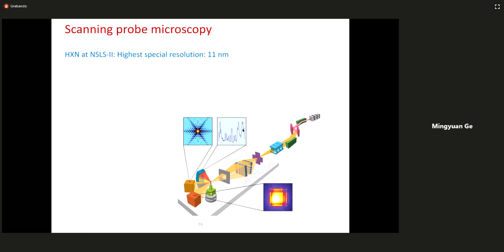There is a fluorescent detector that gives information about the elements. We also have the transmission detector, which detects the Fourier-transformed scattering signal from the sample. It is kind of a Fourier transform of your sample information. By using this and the knowledge we have gained, we can retrieve the phase. We can also have another detector away from the beam path that collects the signal from the Bragg diffraction. From Bragg diffraction signals, we can decompose the strain and stress along certain directions inside the crystal. Because we can collect all of these within the environment, we can get combined information from the element to the phase and to the strain.